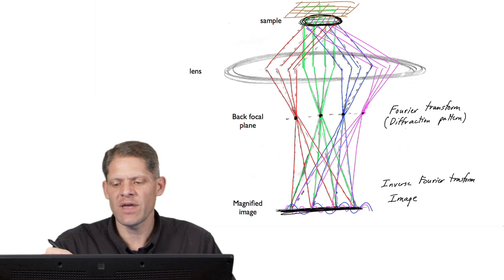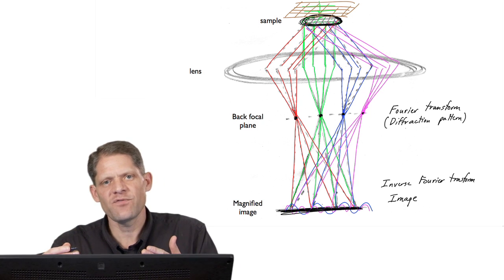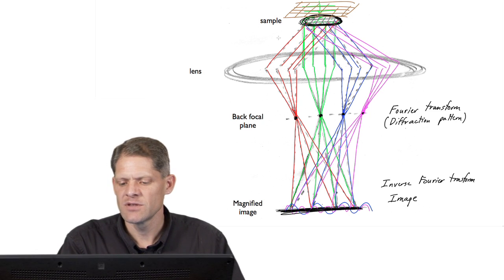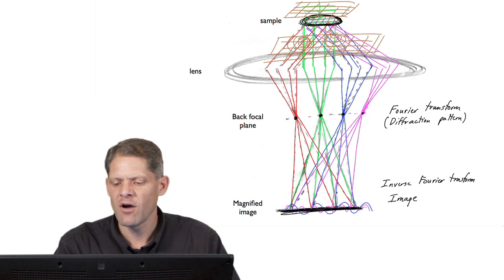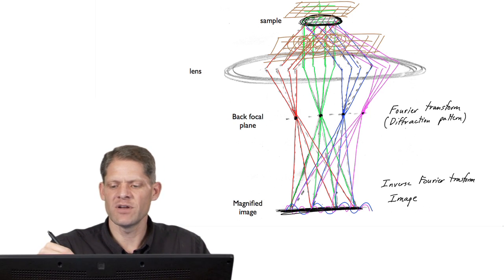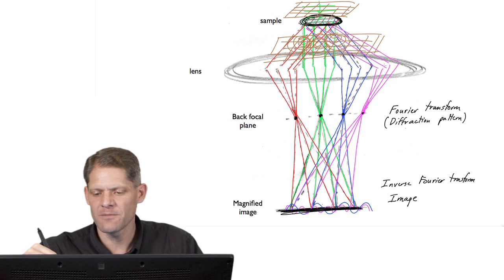As that plane wave interacts with the sample, it delays phases and scatters, so you have phase ripples, so that as that electron wave is now past the sample, it has embedded within it a whole series of ripples, and there are so many you can't draw them. All these ripples together are producing the wave fronts that are traveling in, say, this direction or a higher scattering angle.